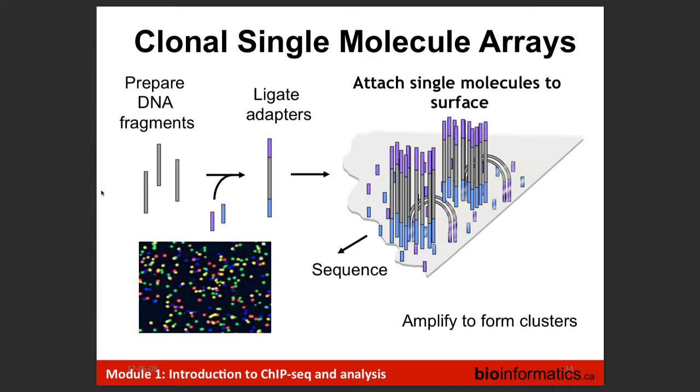And in fact, we published, not to spend too much time on this, but what we found is that when we do MNase digestion and then immunoprecipitate, and then we align those fragments to the genome, we can actually see different lengths depending on the type of target we use. So, for example, for K27 trimethylation, even though when we look at the size distribution of the input, let's say it looks like this, and this is say 200 base pairs, after we do the IP, we actually see a shift in size. And even though the input is all the same size, we're actually enriching for two nucleosome components, probably because the affinity of the antibody is such that we're actually pulling down these. Whereas if we look at H3K4 trimethylation, which marks active promoters, we see a majority of it at the input size.